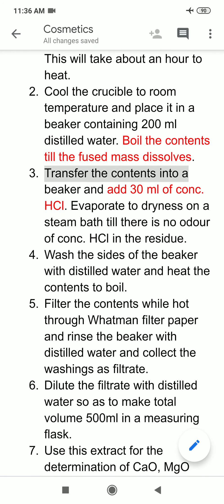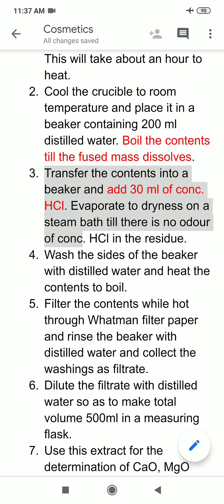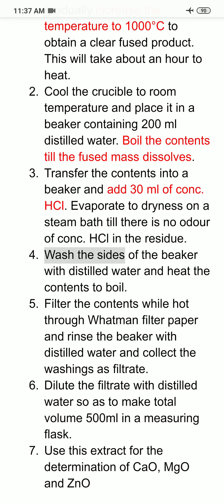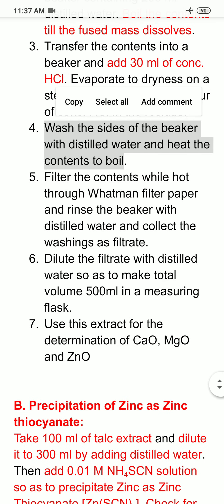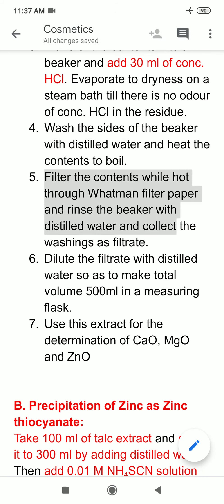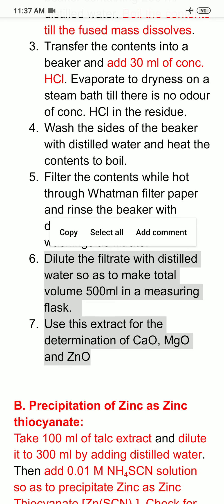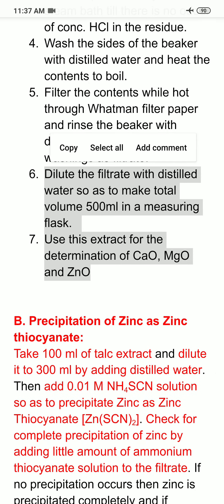Transfer the contents into a beaker and add 30 ml of concentrated HCl. Evaporate to dryness on a steam bath until there is no odor of concentrated HCl in the residue. Wash the residue with distilled water and heat the contents to boiling. Filter the contents while hot through Whatman filter paper, rinse the beaker with distilled water, and collect the washings as filtrate. Dilute the filtrate with distilled water to make a total volume of 500 ml in a measuring flask. Use this extract for the determination of calcium oxide, magnesium oxide, and zinc oxide.